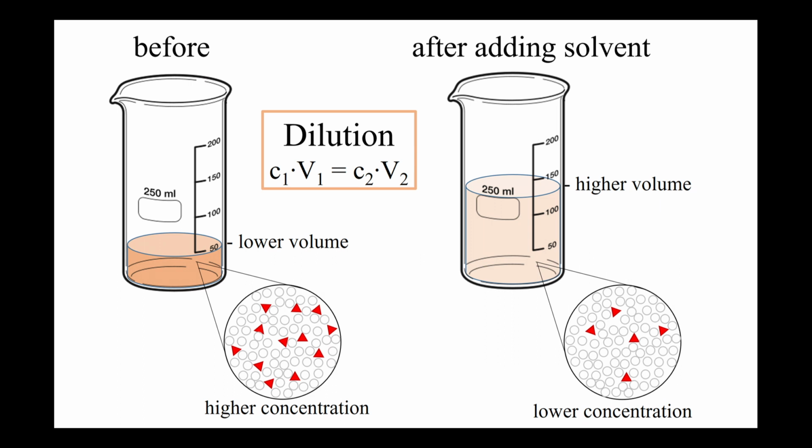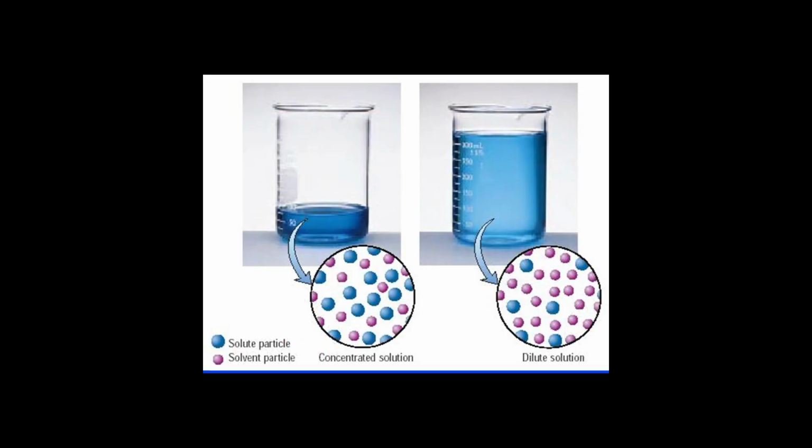Now going back to the iron solution that should have been dissolved by now, we will first dilute it because 18 mol solution is pretty hard to titrate, so we will dilute it by a tenth. So take 25 ml of the solution using a clean pipette that has been rinsed with the solution it will contain and empty it in a 250 ml volumetric flask, and proceed to fill the flask to the mark. This will now make the solution 1.8 molar and will also be worth 1 iron tablet, which is important to know for later.